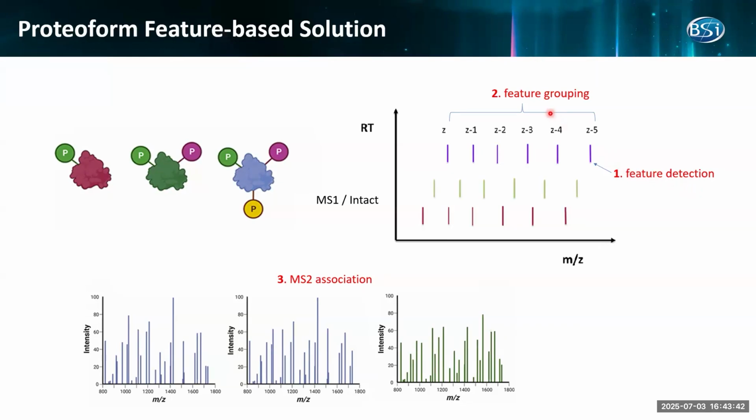Then we group different features belonging to the same proteoform into one group, which we call a proteoform feature. It's not a precursor feature, it's a proteoform feature.